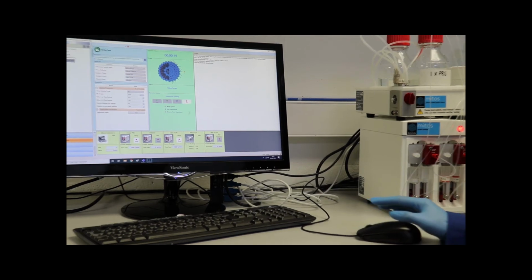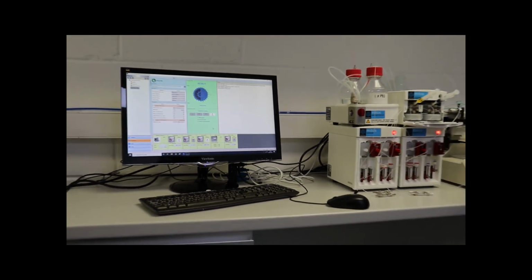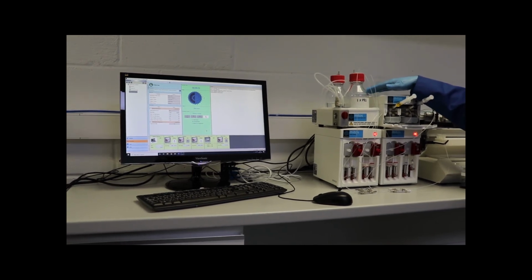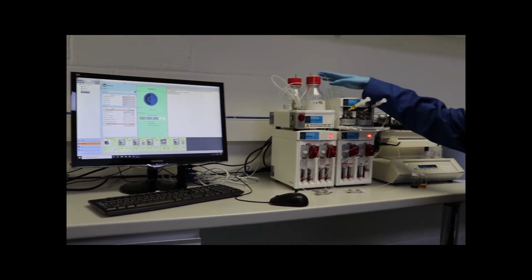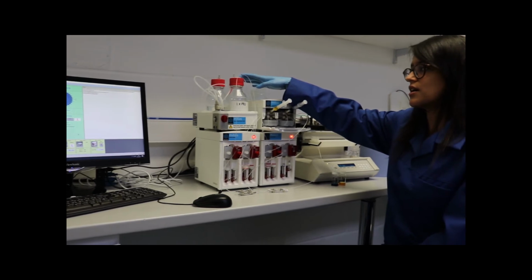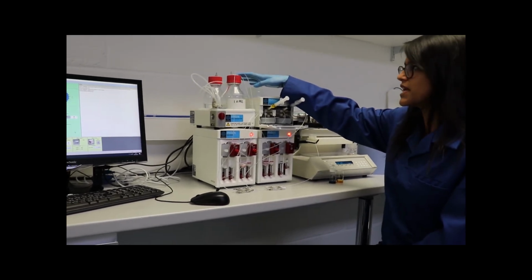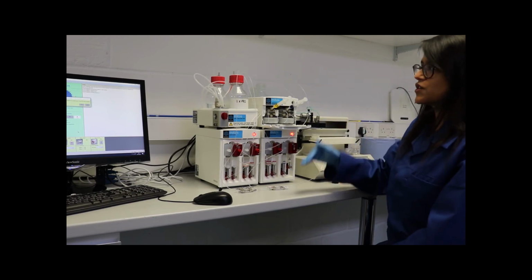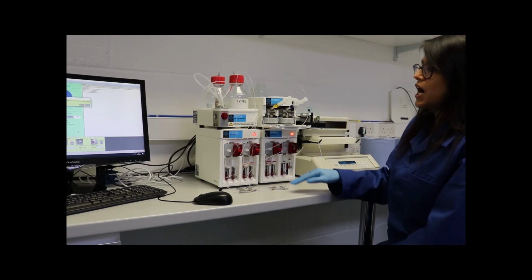This usually happens with the driving fluid that's located in the pressurized input store. In this case, I'm using buffer, just 1 times PBS buffer, to fill all 3 syringes. So this is basically going to act like a driving fluid.